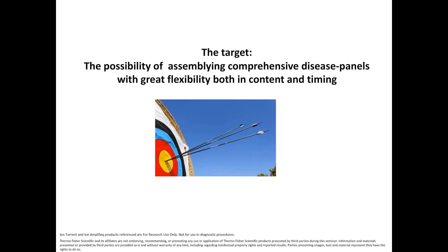So we have to have the possibility of detecting variants with a high confidence, but we also want to be able to detect variants that might have a different representation than the classical allelic one.